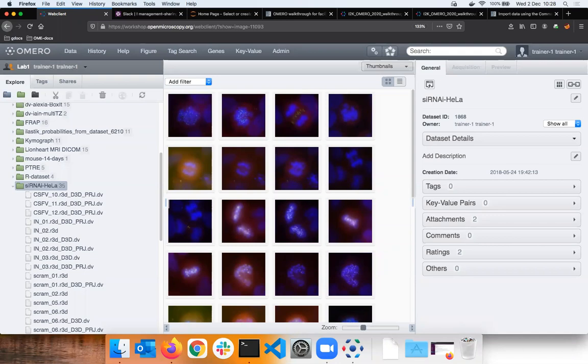So which type of server do you have where your data are stored at the moment? Because we could maybe look at a cron job for you to actually, maybe just as a showcase of how you could get an in-place import. You can watch some directory, and when something comes in, that will come automatically, or even at night, it will say, okay, all the data that are in that folder will be automatically imported into OMERO.